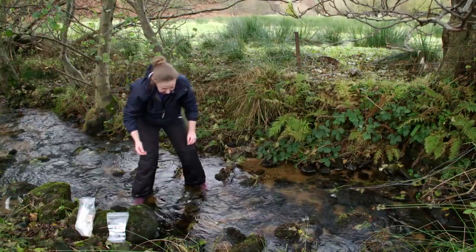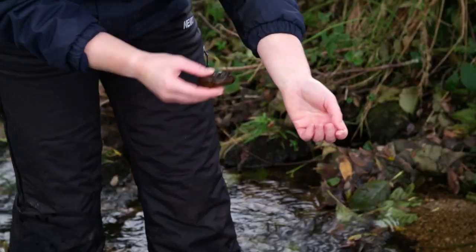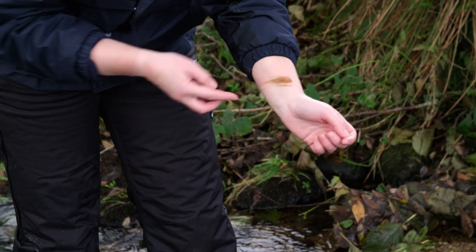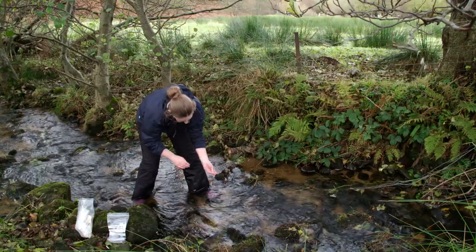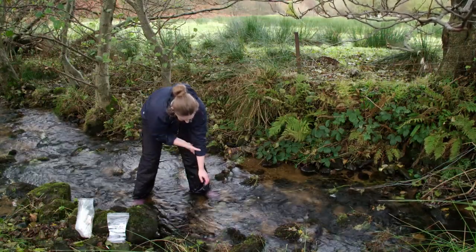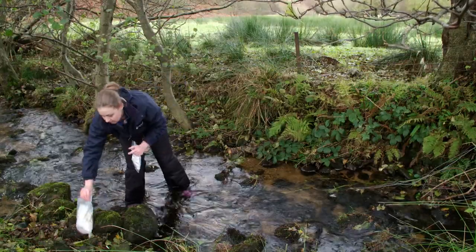An observation must also be made of the stream bed material. In order to do this, take a sample of a variety of clasts from the stream and rub them against the skin of your forearm to create a streak. Take note of the average streak colour and intensity: orange, brown or black. This indicates what materials have precipitated and oxidised on the surface of the stream bed. Collect the polybags, ensuring they are sealed, and leave the stream with caution.